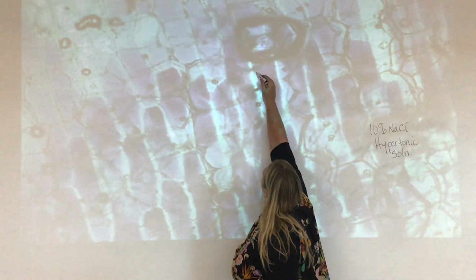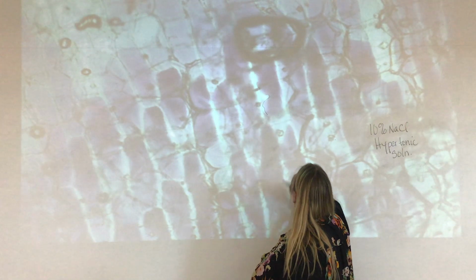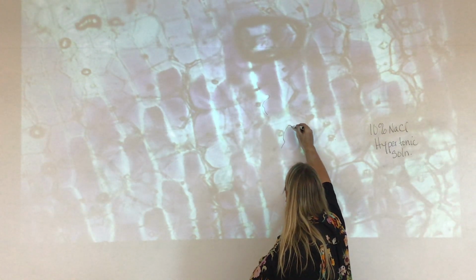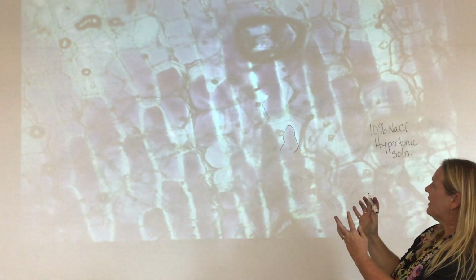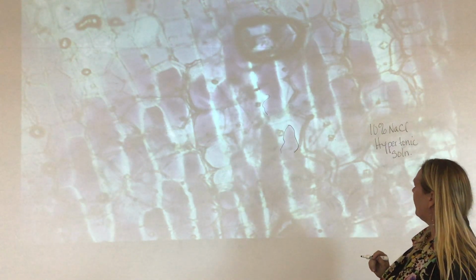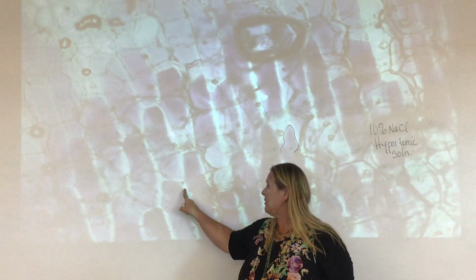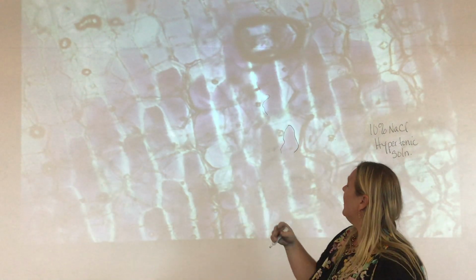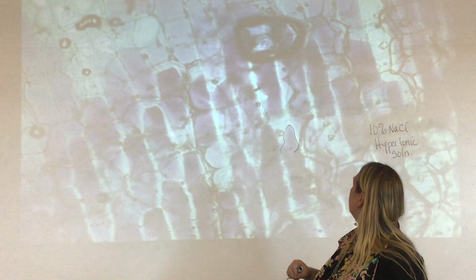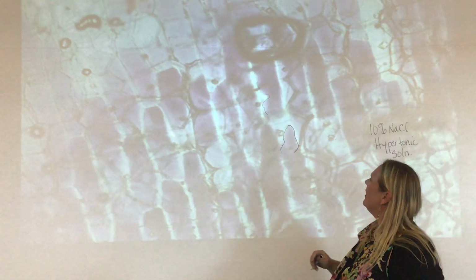I kind of want to draw right there, on the edge of that and maybe right there, to see if while I'm talking we can see the changes in those. But we can also already tell that the space between these cells is wider than the other one. It's not working quite as quickly as it usually does. I always get those in my labs for some reason, okay?